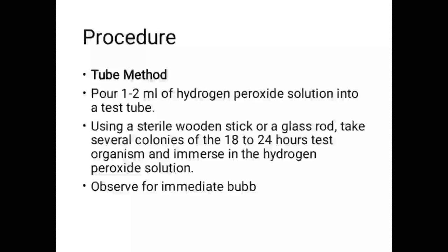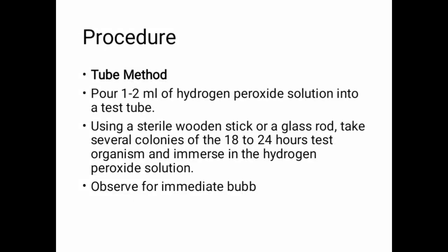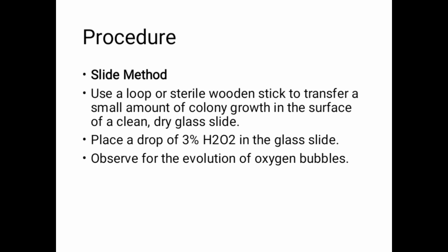If a bubble is produced, it means they are catalase positive, and it will be Staphylococcus.